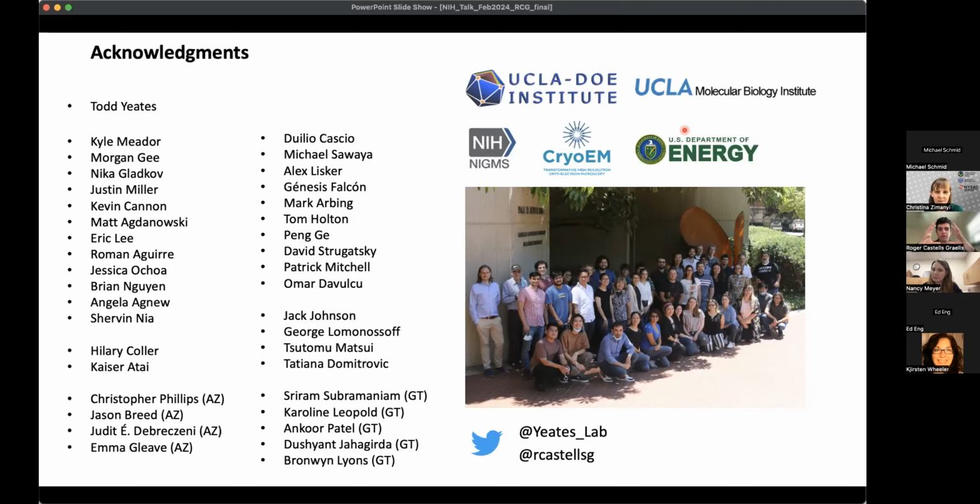We do first the whole assembly, and then we break the symmetry, and then we treat each one of the components individually. But the orientations that we get from the whole assembly are already quite accurate, and we can already see the structure for the components on top. It tends to get to higher resolution when we do these local refinements and extra steps of classification.